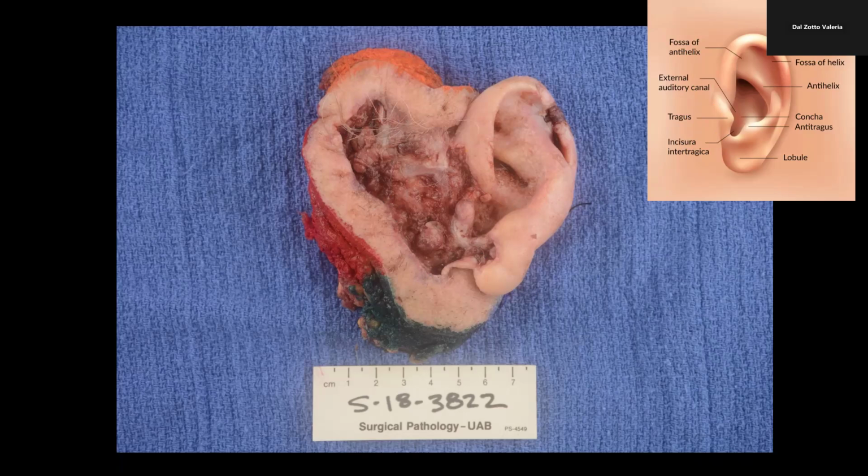The faculty is on the other side, and the faculty doesn't see the lesion. You are looking at the lesion, you are describing, and the faculty will have the mental image of what you are seeing, reading what you are describing. So by reading, I have to have the mental image of what you are looking at during the grossing.